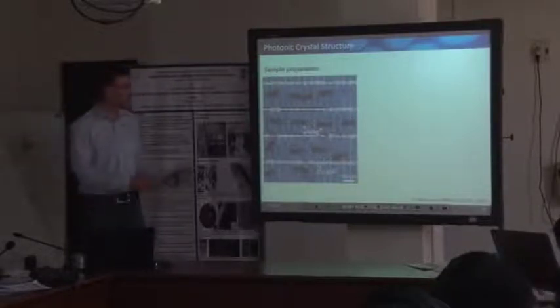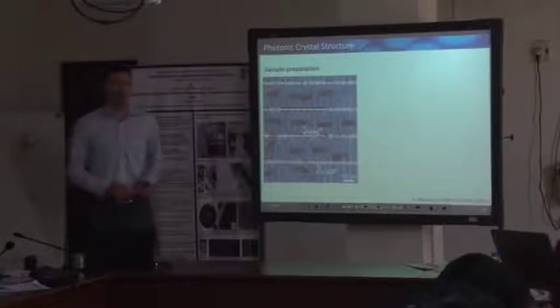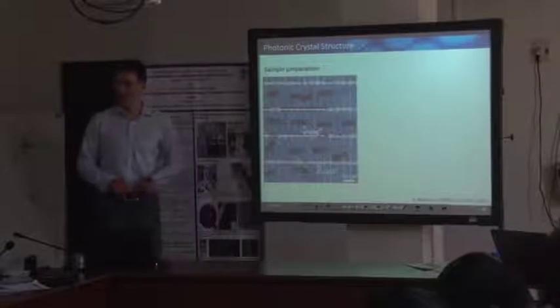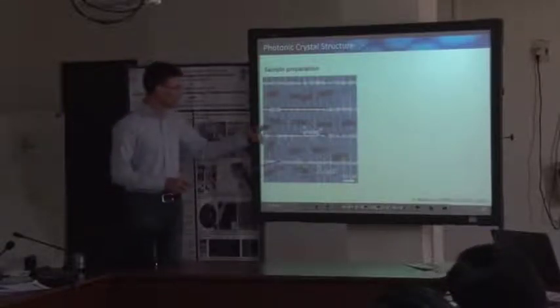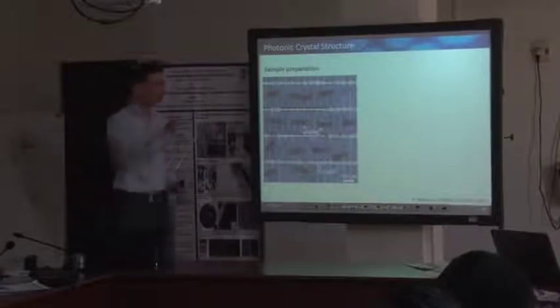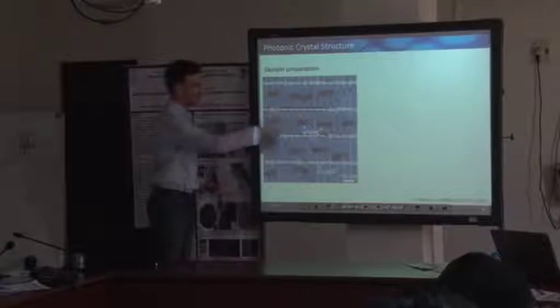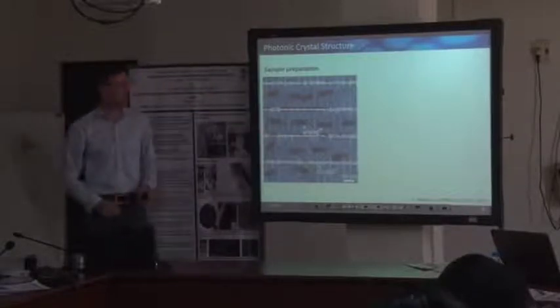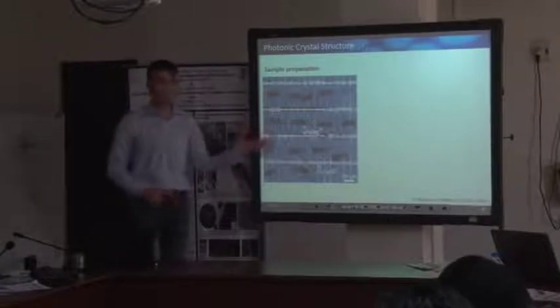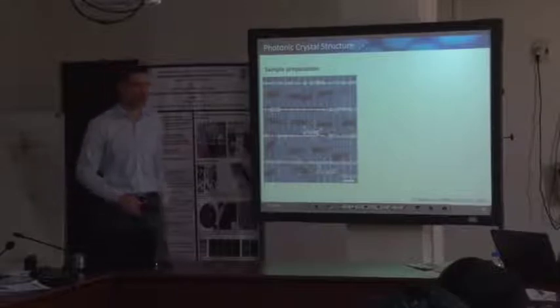So I mean, you can imagine those are just 40 by 200 micrometers. This is pretty small. Even for TEM samples, these scales are very small. And our technician just used a single hair and the adhesion to transfer these onto another grid support, a TEM support. As you can see, we didn't apply 360-degree tomography then, so this was impossible.